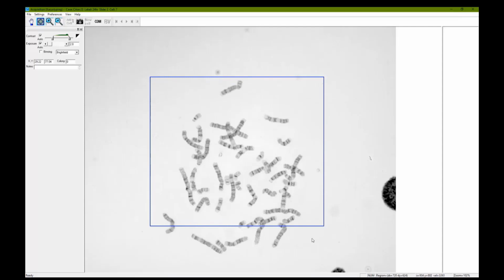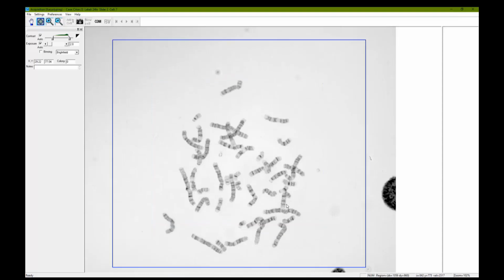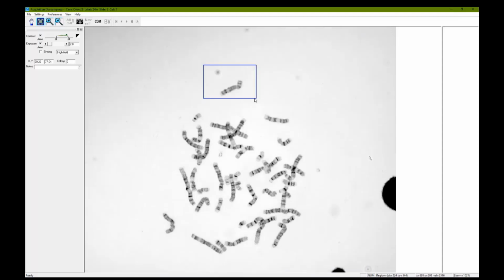Another key feature is that the contrast and exposure is automatic, meaning that the user will draw around the cell of interest and the system will automatically adjust the contrast and exposure to the said default. With other vendors, in addition to them having to take multiple images due to the fixed box, they have to adjust the light source by watching a meter on the screen so that they can get an image in a certain range, and they have to do this with every cell.